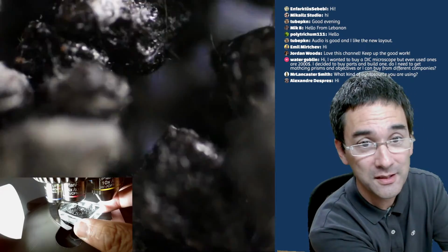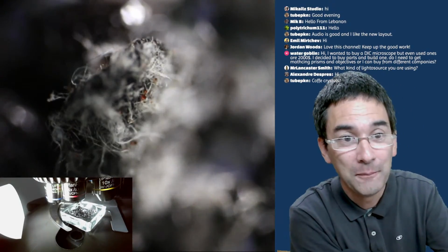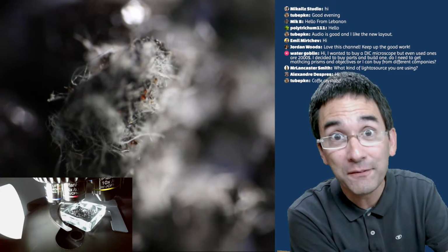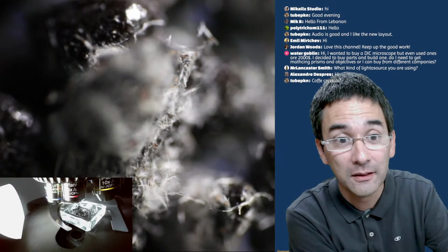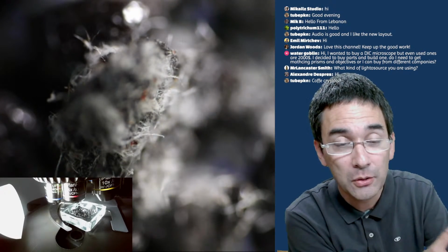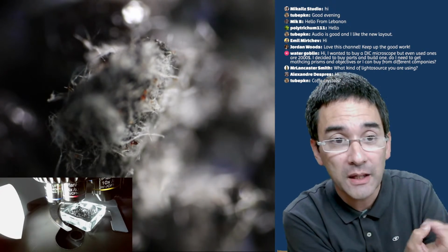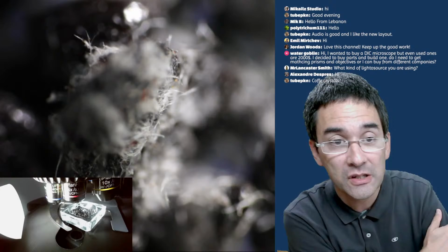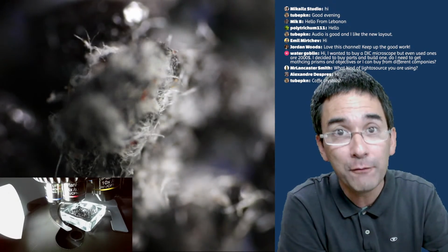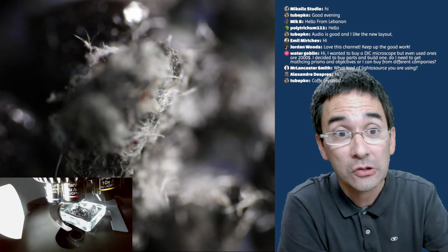When I actually discovered what this is, I said, this is not possible. You won't guess. These are crystals, but what? It's caffeine. These are caffeine crystals, and I suppose that because I did not completely close the coffee and it was a little bit old, the moisture soaked in, and this is why caffeine crystals started to deposit. And why do I think that it's caffeine? Because I actually have pure caffeine, and I crystallized it out, and the crystals look the same.